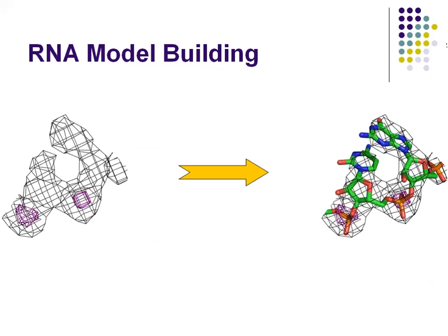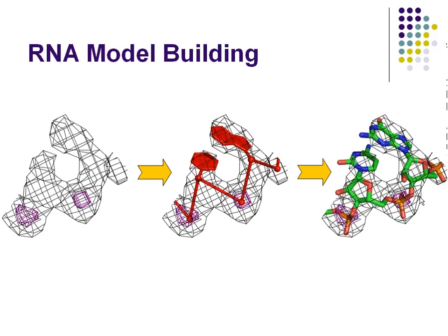RNA model building historically hasn't had very many good tools, or really good ways to go about doing it. A lot of it started out as you stare at the density that's not all that specific, and you try to cram in nucleotides, or stretches of nucleotides, with a lot of guesswork, as I mentioned before, very time-consuming and fairly inaccurate. So with RCrane, what I've tried to do is add an extra step into the model building process, where you'd have a human being go from the density map, and with the help of the plugin, do this basic low-level trace of the backbone.